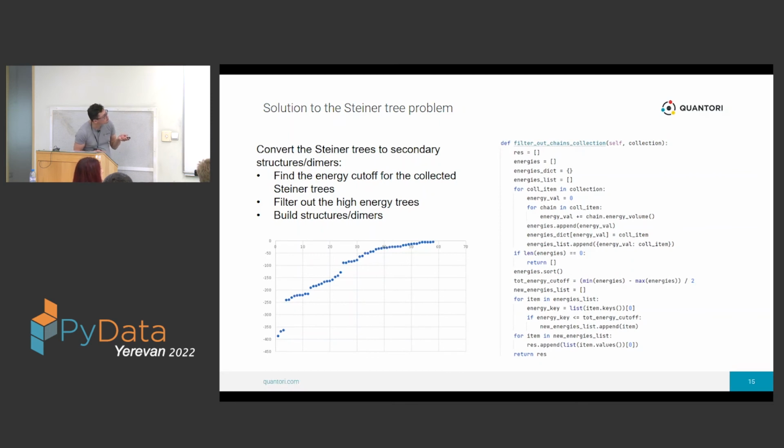And we have found a total energy cutoff. Here it is, I believe. And everything which comes above is filtered out. That's not the best Pythonic way. Of course, I have already updated this, but here is the outdated code snippet. So as soon as it's cut off, we have combinations of trees which are energetic enough to produce stable structures.